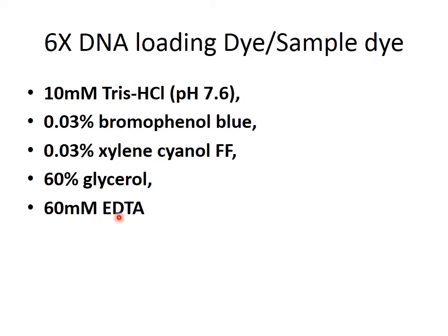It contains EDTA in it. EDTA is a chelating agent, and again this is to inhibit any nucleic acid modifying enzymes, because these enzymes use magnesium ions as a cofactor. So EDTA will sequester any cations which are present in the medium.